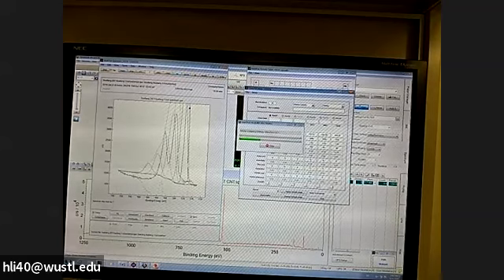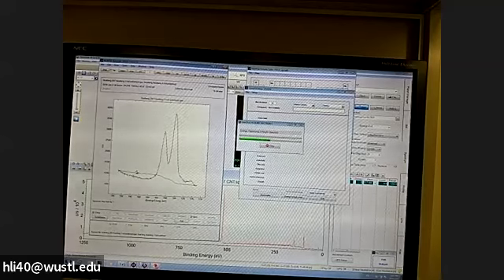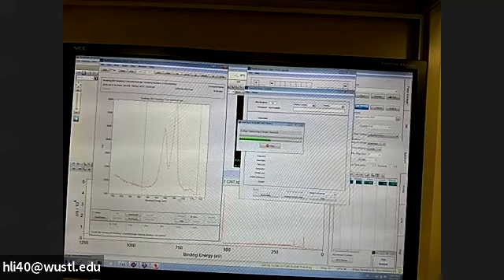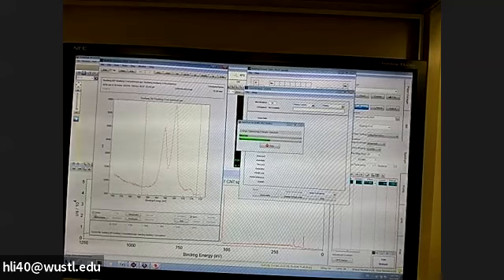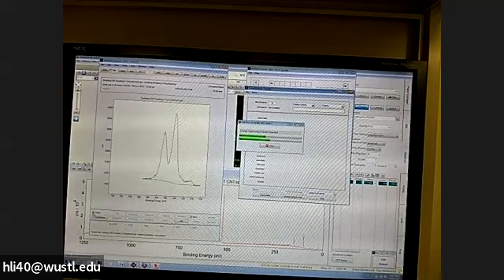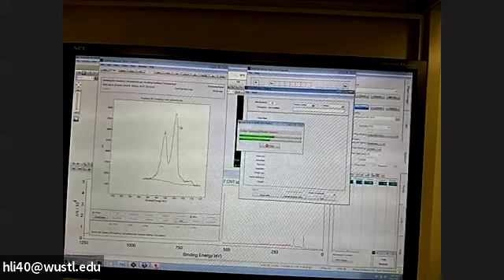Okay, there are so many fittings there, which doesn't make sense. We delete all. First, we need to adjust the baseline. This baseline is not right. So we click setup and then you adjust the baseline. All right. So after you finish adjusting the baseline, after you're satisfied, you check this again. So this will be your baseline and this is your spectrum.